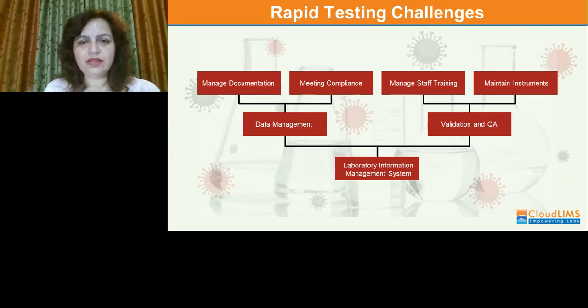Even so, the turnaround times have been slow due to a variety of factors, from lack of in-house trained staff, to paucity of laboratory resources to handle high volumes of tests, and slower than expected test kit production, to actually getting diagnostic assays that are rapid and still accurate in their diagnosis. The challenges that the testing labs have faced have been enormous.